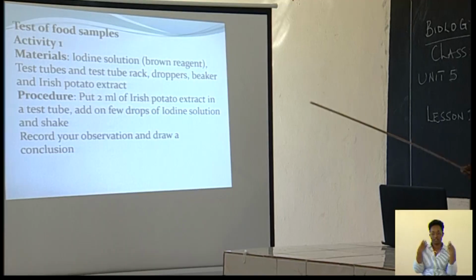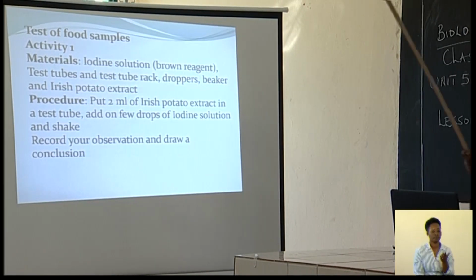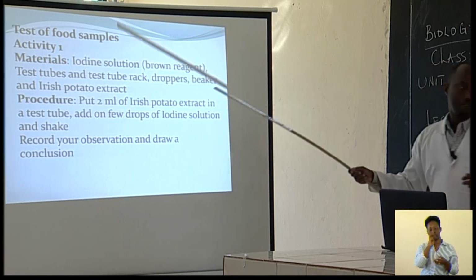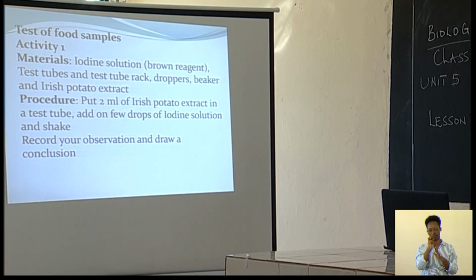We also have to use droppers. If you don't know droppers, these are droppers. Thirdly, we have beakers. I also have examples of the beakers. We use these beakers to conduct our experiment, students. I think you are following what I'm doing.